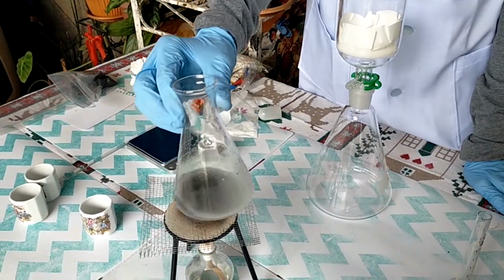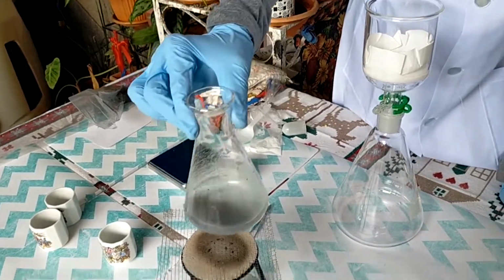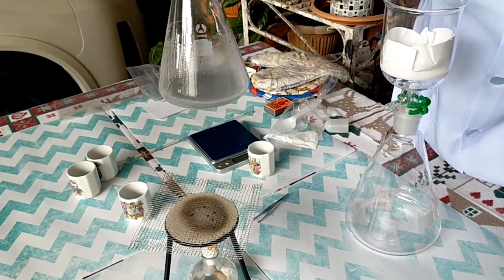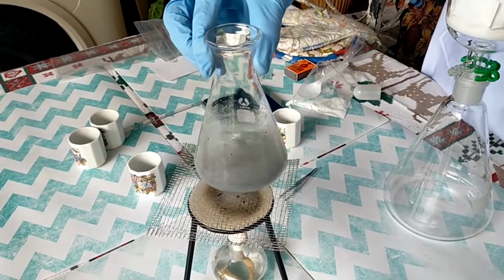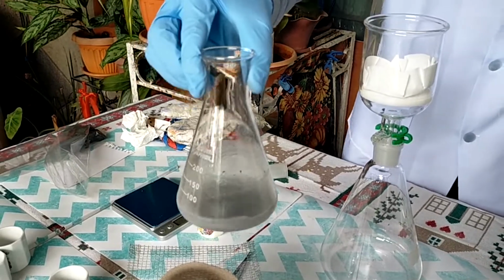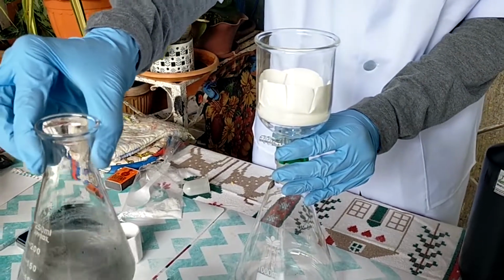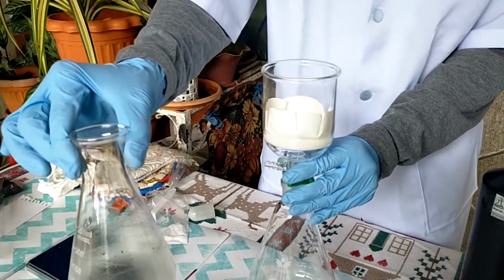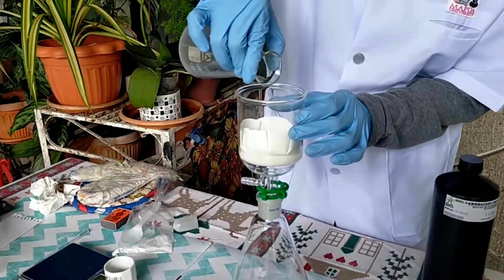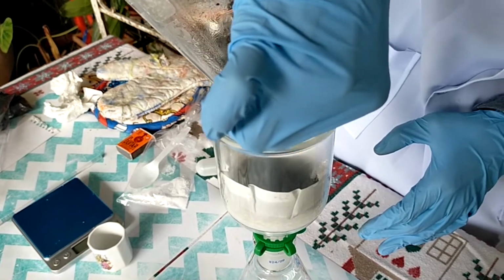Okay, now that it seems that the naphthalene has been fully dissolved in this system, we can now proceed to filter. So I'll just wait a couple more seconds. Okay. So now that our naphthalene has been fully dissolved, we will now filter this using our filtration set. So we improvised gravity filtration since a vacuum filtration set is not readily available at this moment. So I will immediately pour here and wait until it drops.